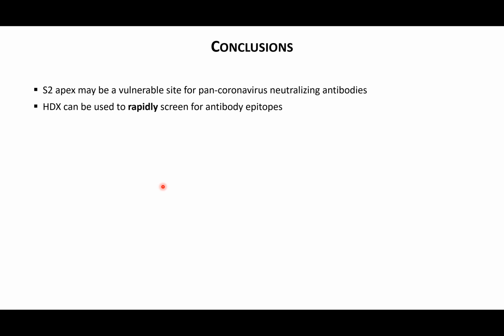that can be recombinantly expressed in your lab and used quite easily. The question is whether you want to use those enzymes before or after you do your HDX experiment, because now we have that as a possibility, right? You can say, I can do my binding experiment, or whatever my state A and state B are, with all of the modifications there. And then I can just remove the modifications after quenching. Or you can decide, I want to get rid of them all at the outset, and then do your state A and state B comparison.